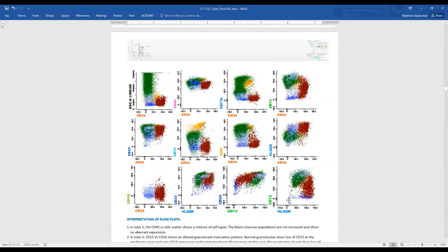For erythroid lineage, there can be a decreased expression of CD71. In the myeloid lineages, like I said, there could be asynchrony in the acquisition of 13, 11B, 16, and 10. And if you remember, your dysplastic granulocytes often have low side scatter and they have hyposegmented lobes. Those are the elements that contribute to side scatter, the complexity of the cell and the granularity.